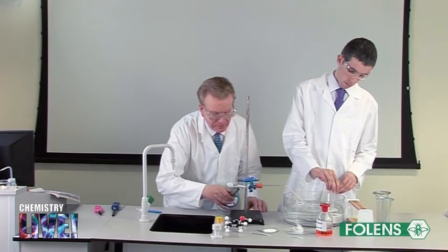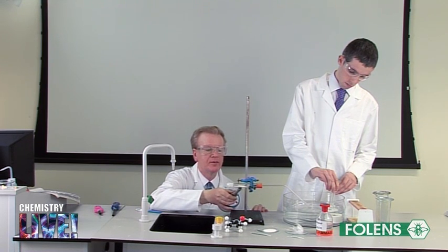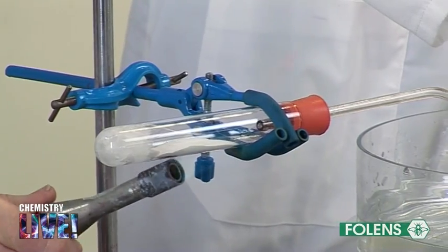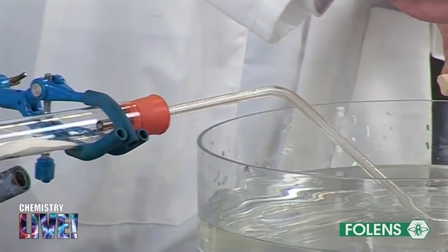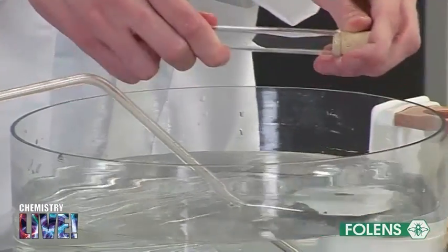Collect five test tubes of the gas. Put a stopper on each test tube as it is filled.